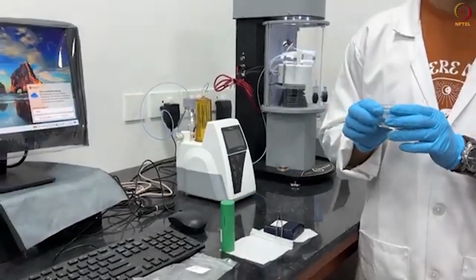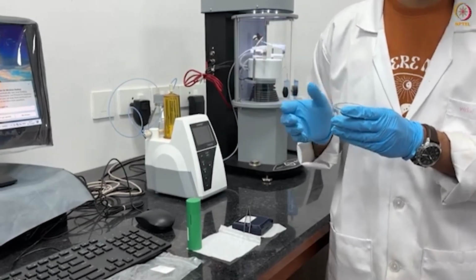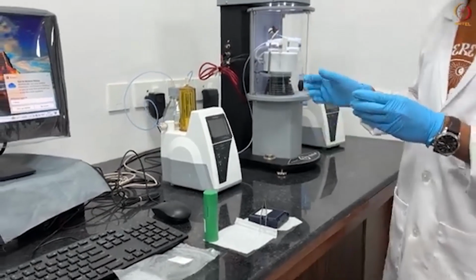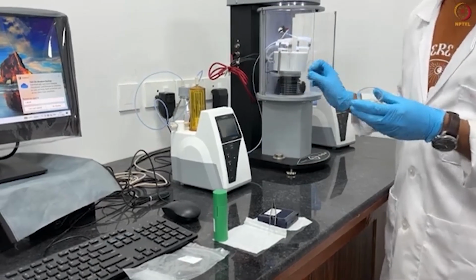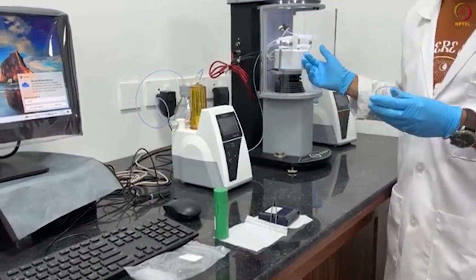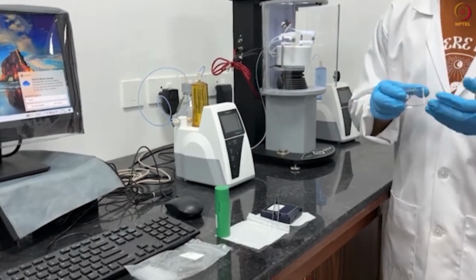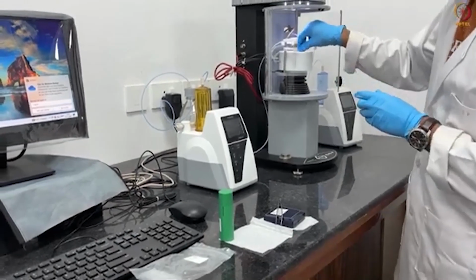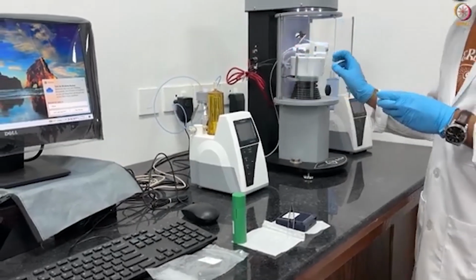This is our sample vessel. As I told you, one can use this vessel directly, which is available in the instrument. If you want to change the temperature or maintain a specific condition, you can use this vessel too. However, cleaning can sometimes be challenging. For easy handling, you can use a 50 ml or 100 ml sample vial, which can be placed inside the system like this. Both volumes are available for use.